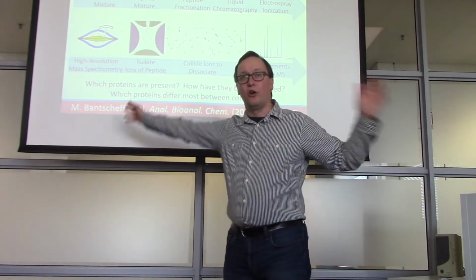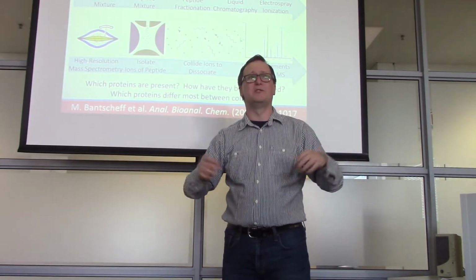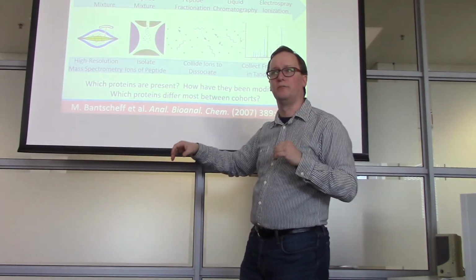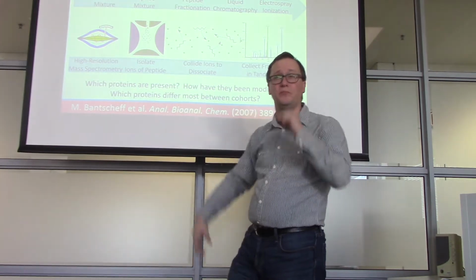Okay, so what does this whole crazy workflow look like? Sometimes it's useful to have just this view from 20,000 feet to get some sense of what's going on. We start with a protein mixture.